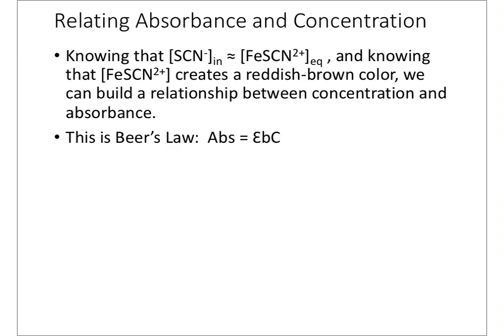All right, now this is related to something known as the absorbance. So what the spectrophotometer does is it shines light through your solution and it measures how much of that light is actually transmitted through your solution. And the amount that's lost, we just say that that's the absorbance.